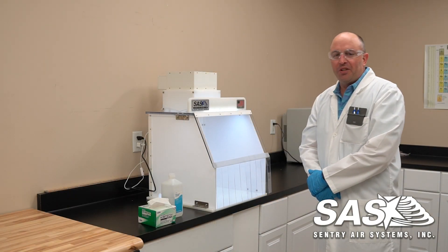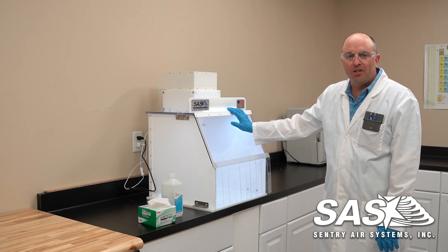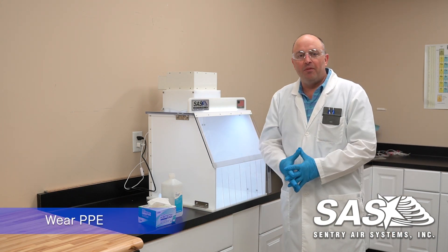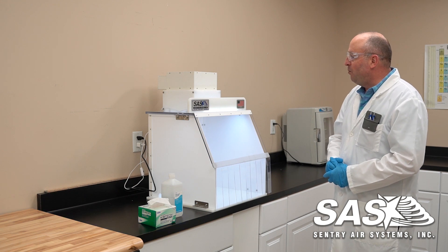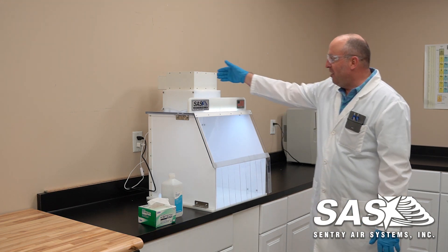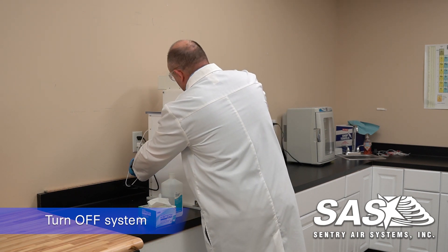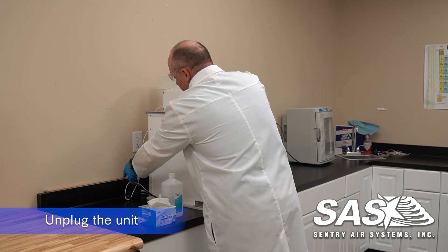Hi, my name is Seth and here at Century Air Systems we're going to be going over how you clean the inside of our 218 PCR. I recommend starting off with the right PPE — gloves and eye protection. First thing we want to do is shut off the chassis, the blower, as well as the lights. And once you have it shut off, we recommend unplugging them to be safe.